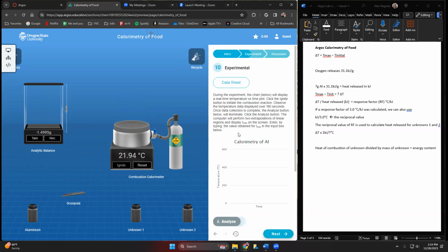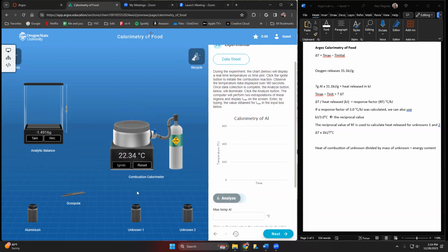We're now going to prepare to combust this. This reaction does take 3 minutes, so you do have to wait that, right? There's no way to speed it up. This will take 3 minutes. The unknown will take 3 minutes. The other unknown is going to take 3 minutes. But we do have to get some oxygen in here because we're going to combust this in the presence of oxygen. So we're going to open this up for about 10 seconds. If you go over the 10 seconds, it's perfectly fine. You just need to put in enough oxygen, and we do that by 10 seconds at least. So you see that it's 14 seconds, perfectly fine. I'm going to hit this lever, and I've stopped it here.